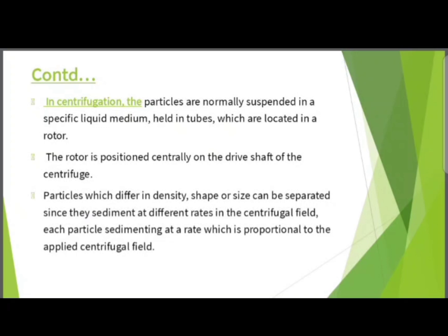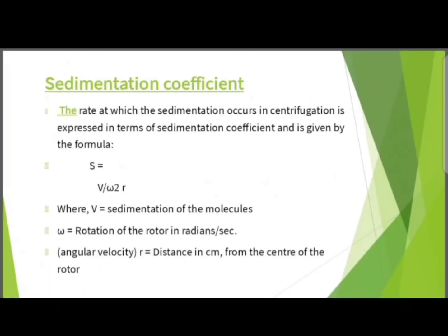Particles which differ in density, shape, or size can be separated, since they sediment at different rates in the centrifugal field, each particle sedimenting at a rate which is proportional to the applied centrifugal force.